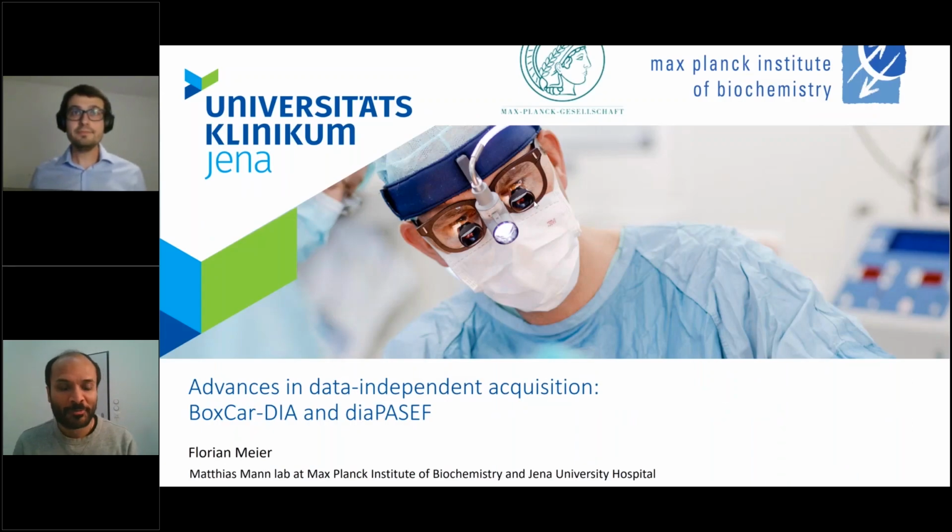Thanks, Florian, for the nice talk. Actually, I have a question regarding the deep learning collision cross-section part that you showed. So does this mean that you can use it to predict ion mobility annotation for libraries that you already had from other projects and use it to analyze your DIA data?